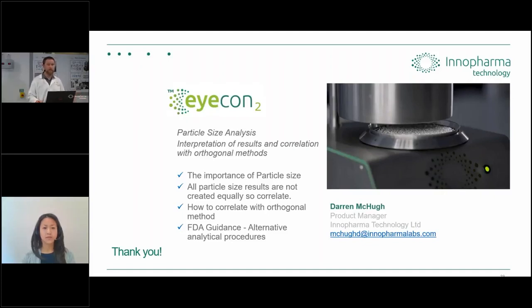It is somewhat company-centric. They do have their own validation plans from their interpretation of FDA guidelines, and we can work with those as well. So we have seen different ways of doing that. We also provide verification kits, size verification kits, with the equipment, meaning basically if you put a known size standard underneath the instrument, you'll get a known result back. That's another method toward validation as well, and that's part of our installation, operation, and qualification packages.